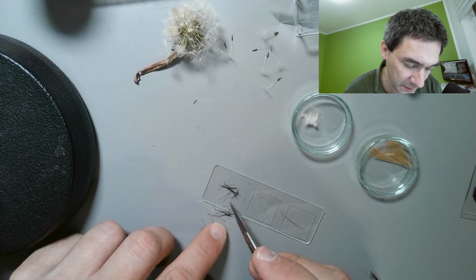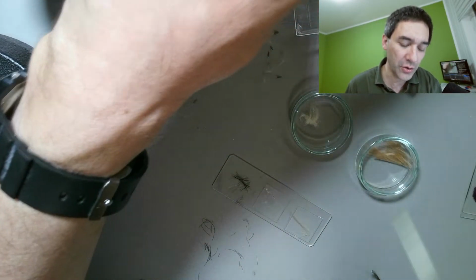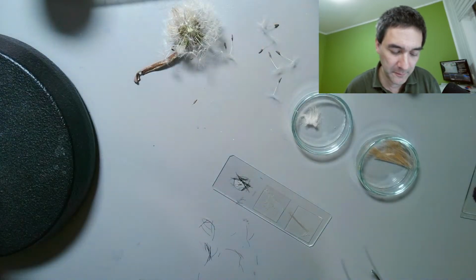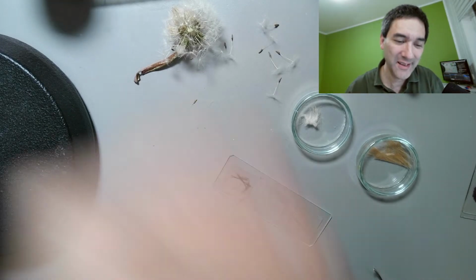I think there is some white here as well. And the question is, is it also textured? Actually, maybe I should rename the title of this live stream a little bit.